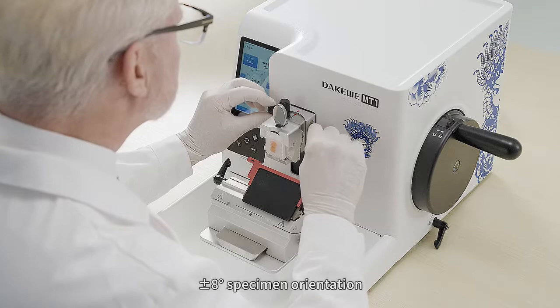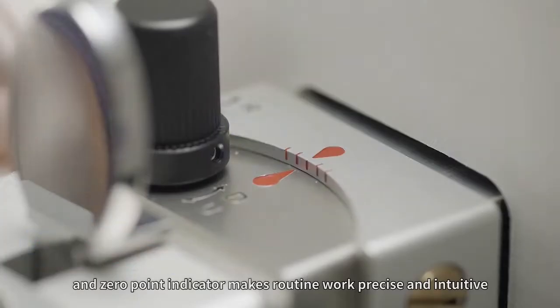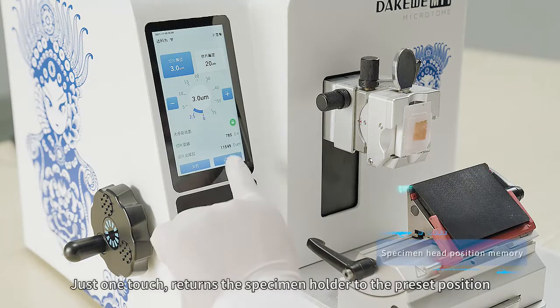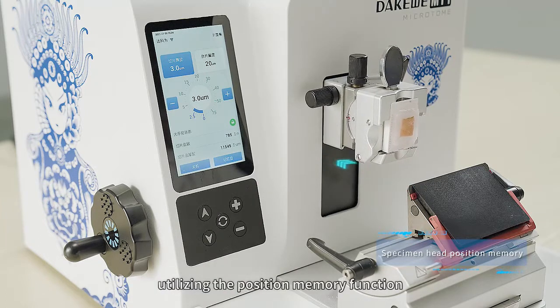Plus/minus 8 degrees specimen orientation and a zero point indicator make routine work precise and intuitive. Just one touch returns the specimen holder to the preset position, utilizing the position memory function.